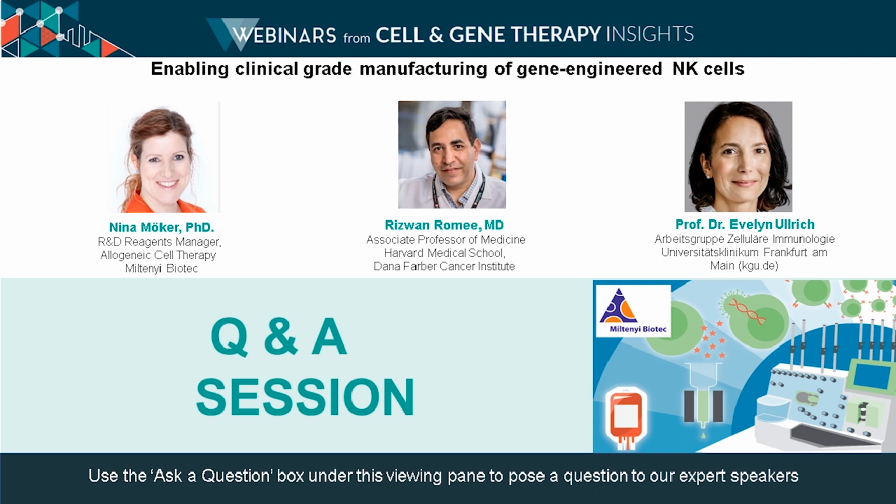So in the US, for CAR T-cell manufacturing in the Prodigy, the recommended clean room class is C. And in Germany, we are currently working towards approval for clean room class D for the engineering in the Prodigy. Then, of course, the manufacturing protocol must be highly reproducible under the situation of donor-to-donor variations. So it has to be set up in a way that ensures efficient transduction and expansion from every donor.